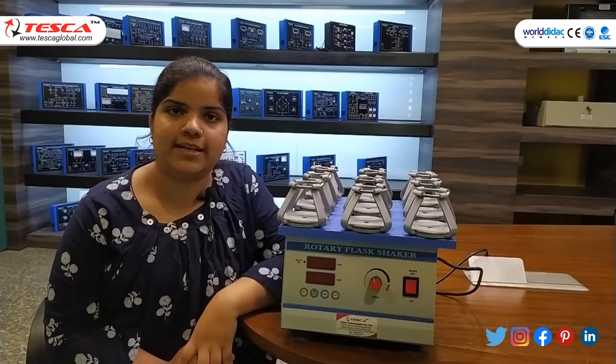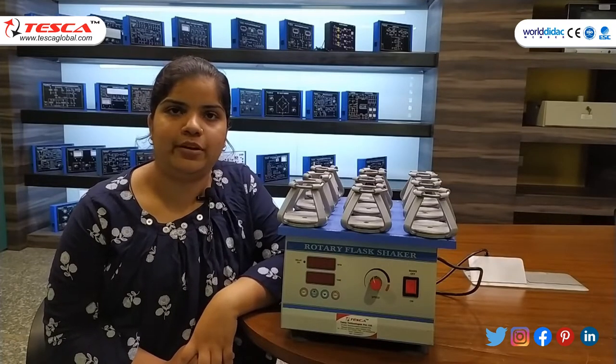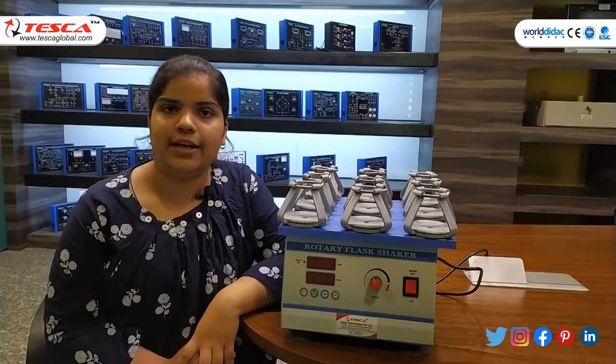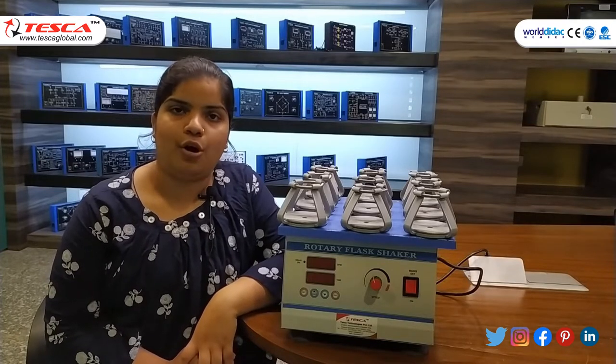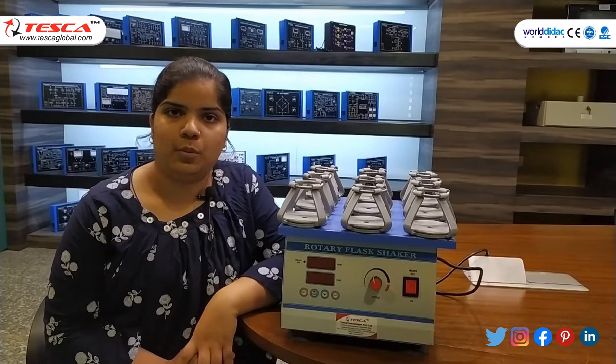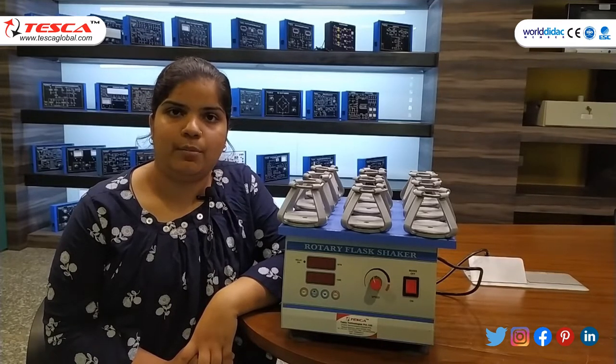Hello guys, welcome to Tesca Technologies Private Limited in Jaipur. Myself Nitali Jain, and in today's session we will learn about the rotary flask shaker. The order code is 21225207.6.